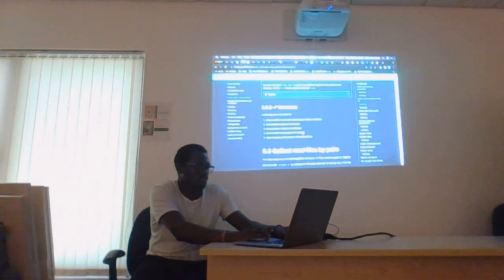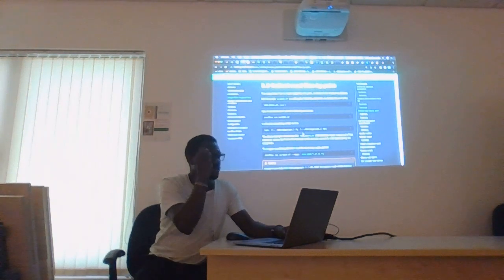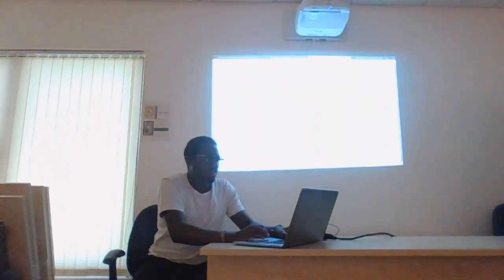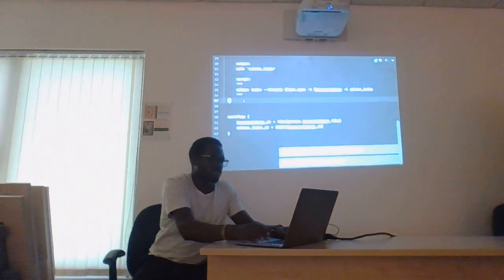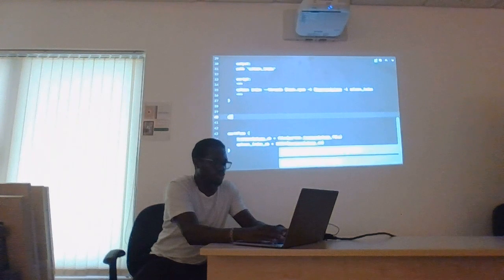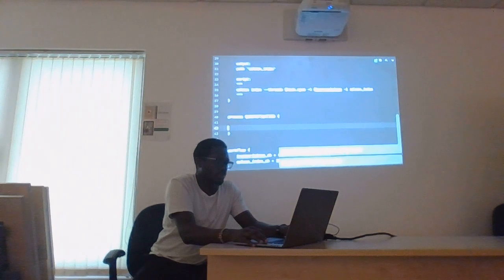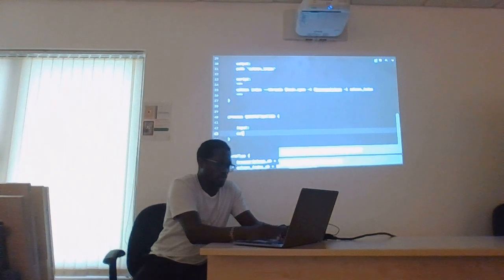Now to the second task, which was about quantification. The most important thing there was for us to have a channel for the reads, which is our input. So in the same way, we begin another process and we call it quantification. Again here, we put our input, output, and then script.